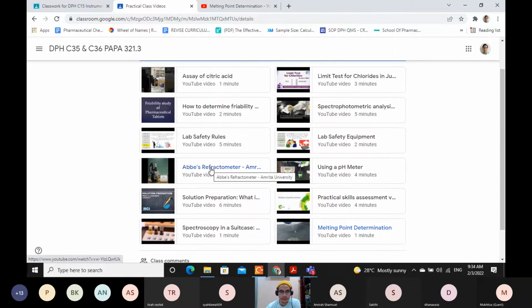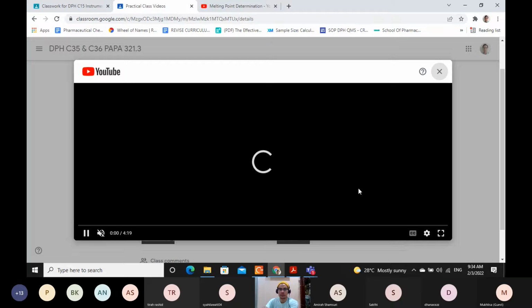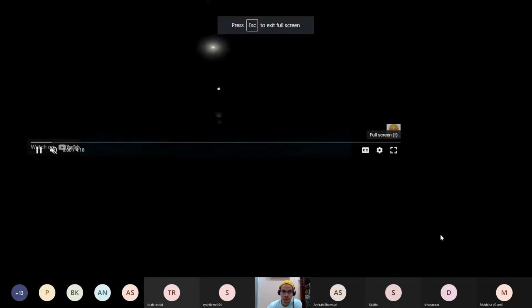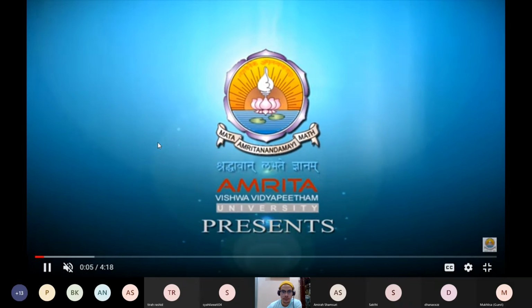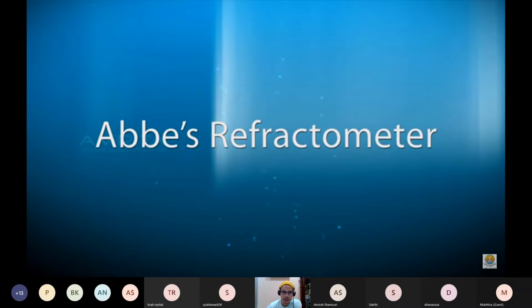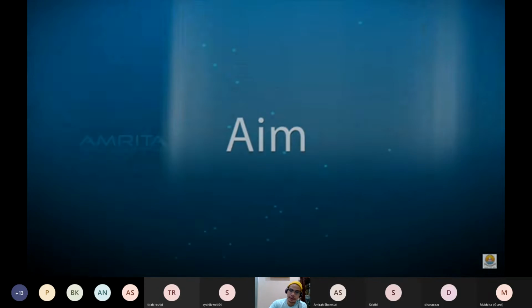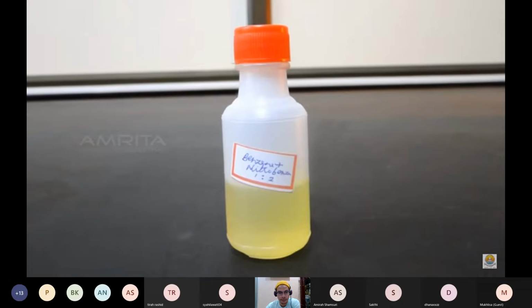Refractive index, okay. So this is a video about using Abbe's refractometer untuk buat determination of refractive index.